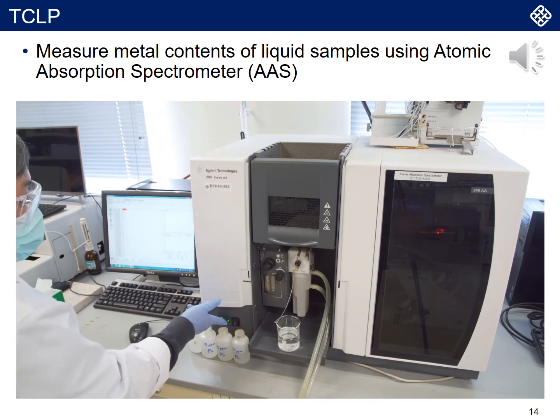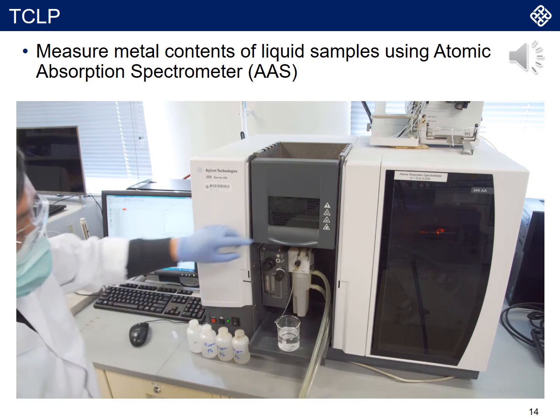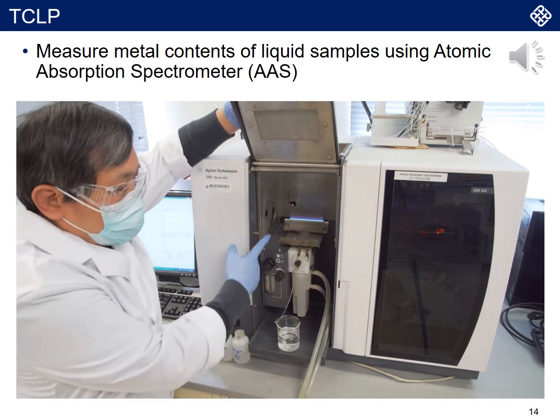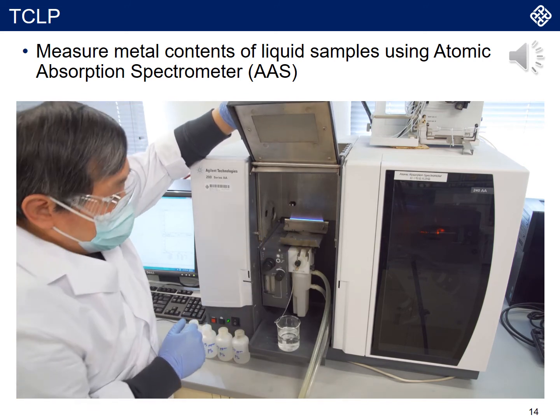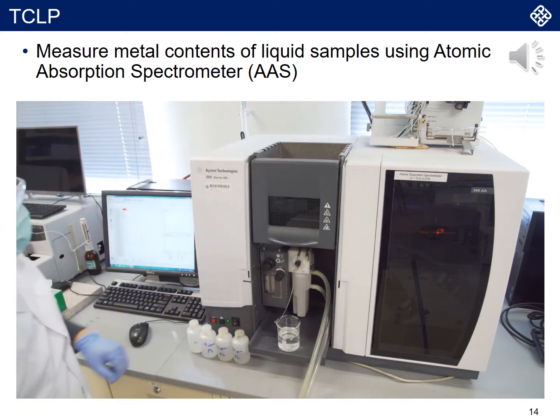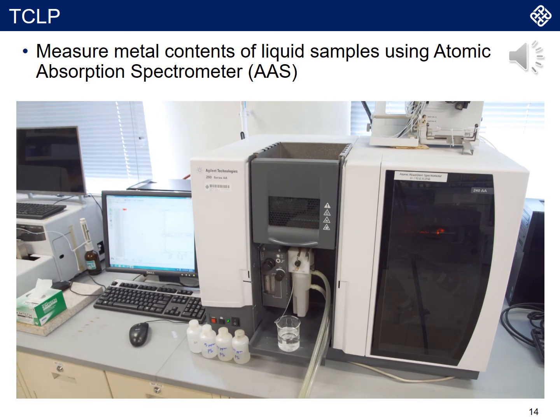high temperature. You can see that when the experiment is carried out, there is a beam of light passing through that fire. You see the fire, and it is transferred into wavelength.